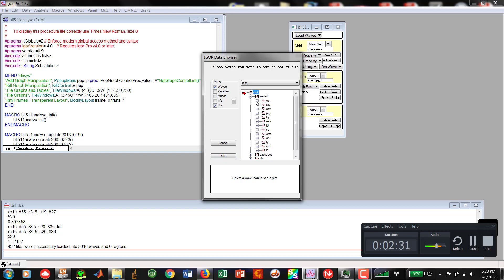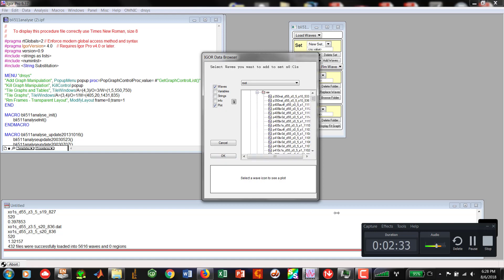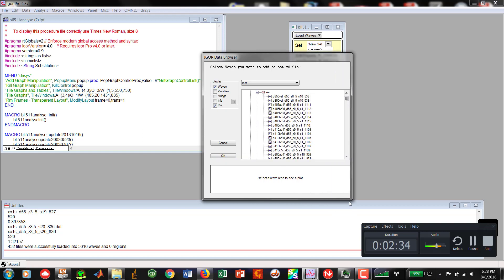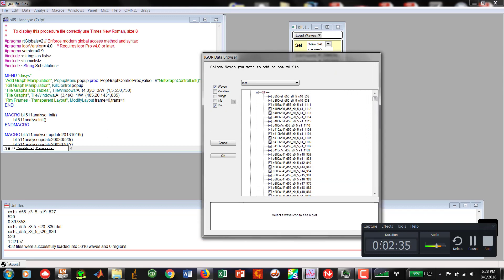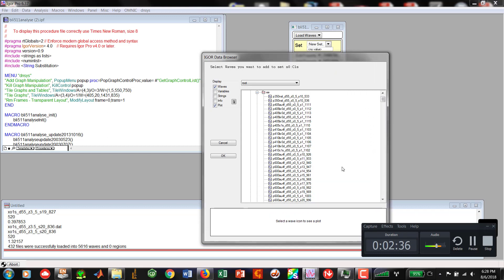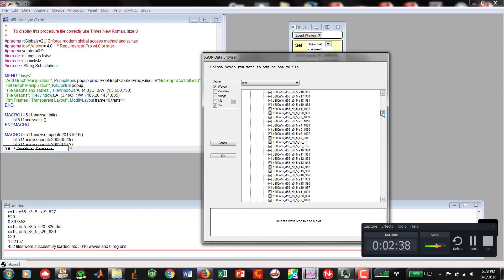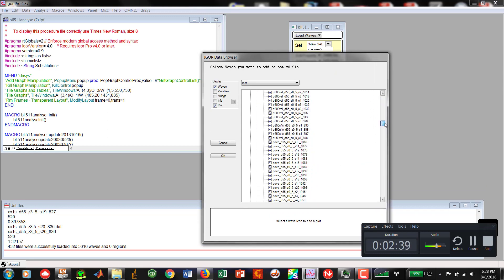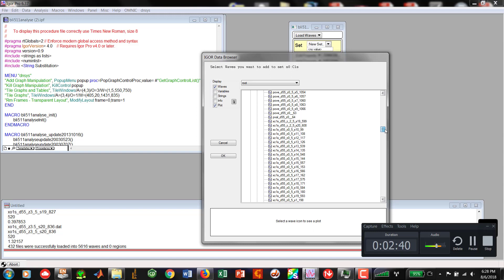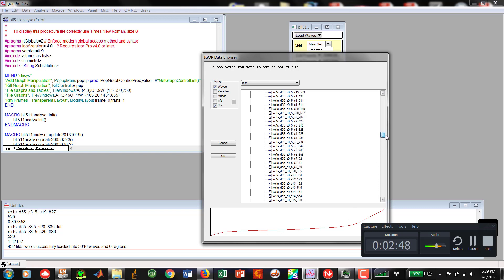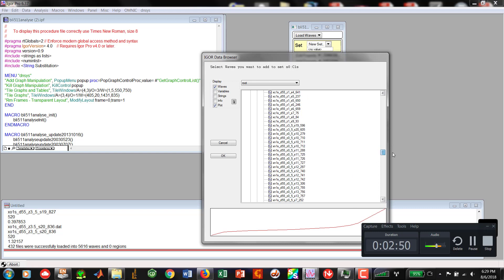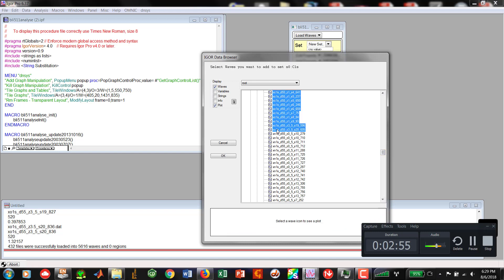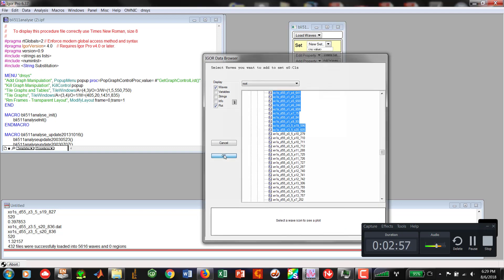So let's go over to loaded, go over to EE, and you'll notice all those data sets are in there. We're going to leave them in there because that's our root, and we can pick nitrogen, boron, whatever we want. And I'm going to go down to carbon where it starts. You'll notice that that's our X waves. I'm going to click all the way down until I finish off carbon. I'm going to hit OK.